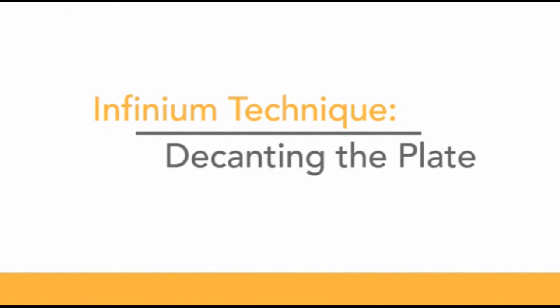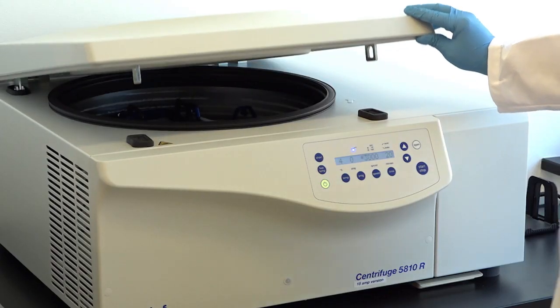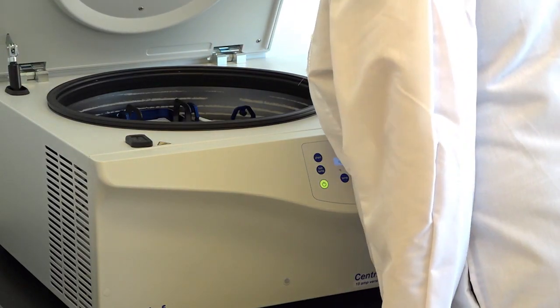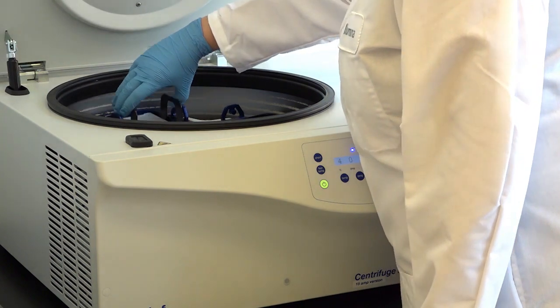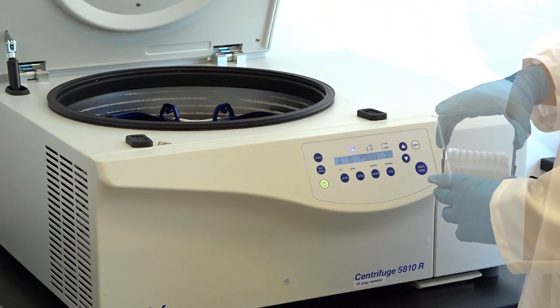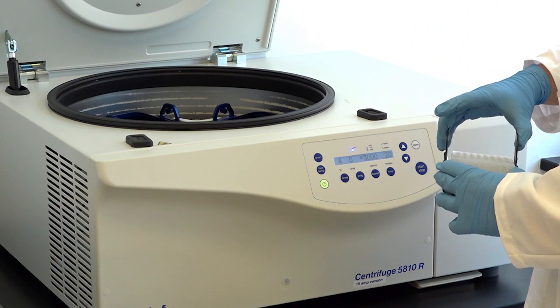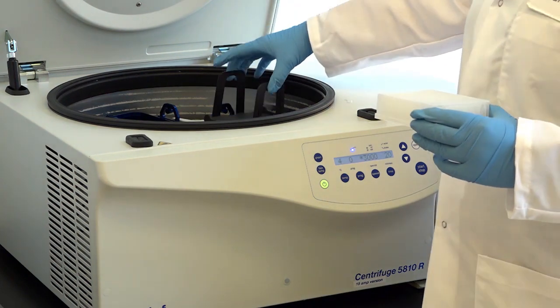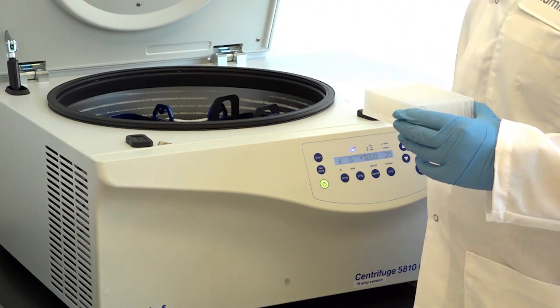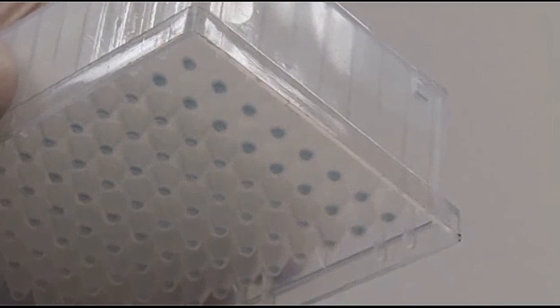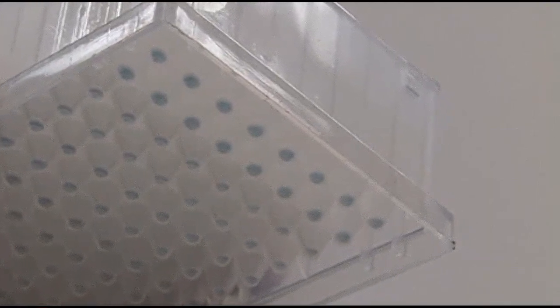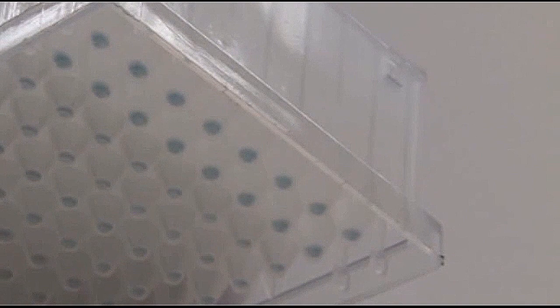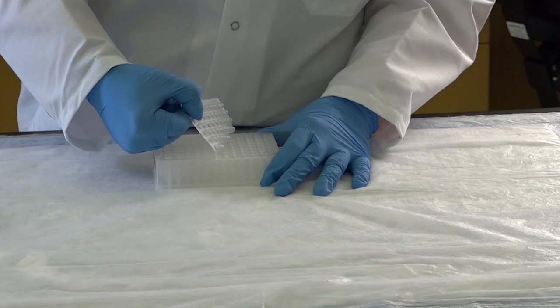In this step, we will look at the technique for decanting the supernatant from the pellet following the precipitation step. It is important to remove the amplification plate from the centrifuge immediately following the 20-minute spin described in the EUCs. Delays can cause the pellet to loosen and may lead to loss of sample. If a delay occurs, re-spin the plate prior to proceeding. This is a typical amplification plate following the precipitation step. The DNA pellets should be blue and clearly visible at the bottom of each well. The benchtop should have an absorbent pad ready for the decanting procedure.